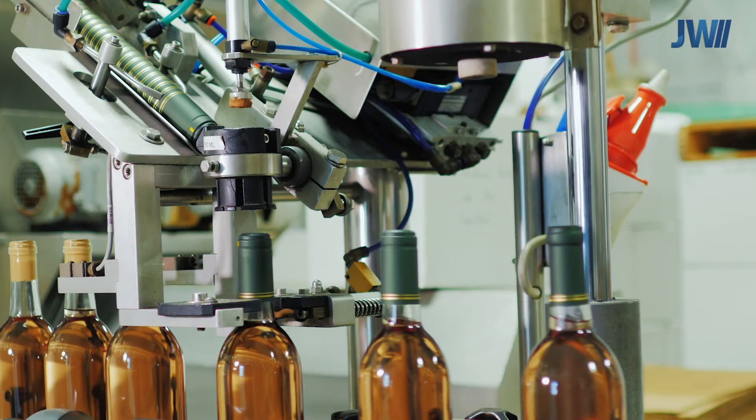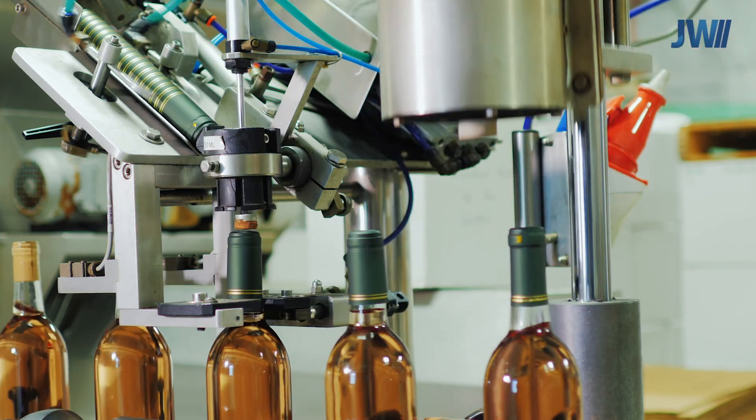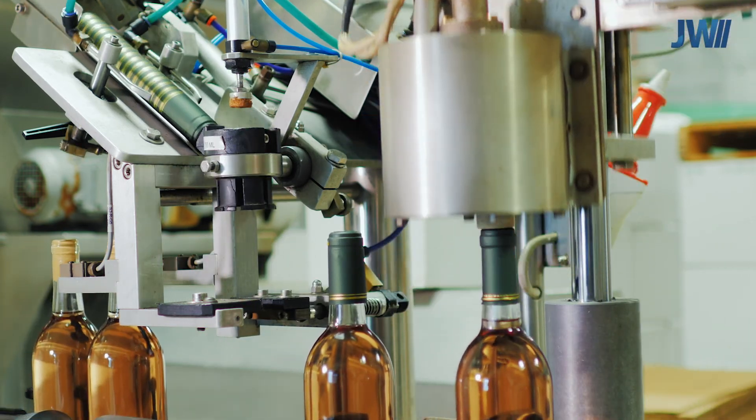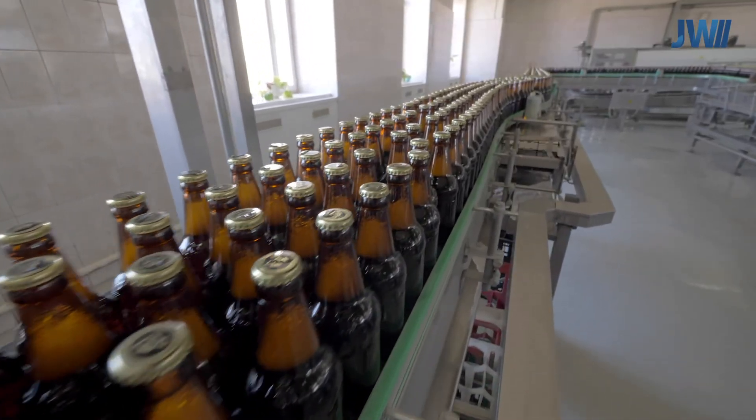Using refractive index technology from Maselli, you can be assured the final product is within specification. Inline analyzer modules from Maselli help our clients with real-time process control. This helps improve quality and yield.